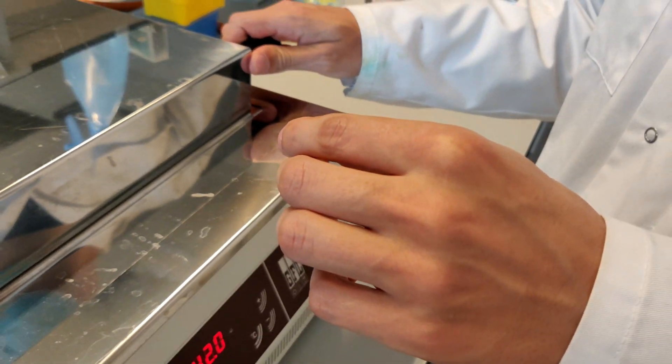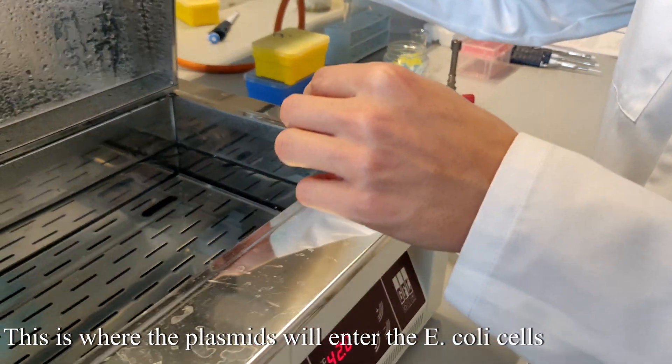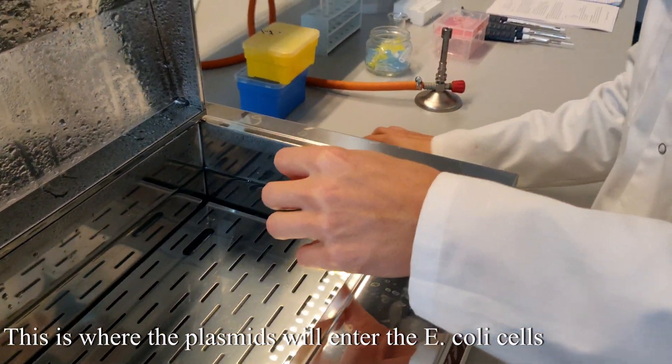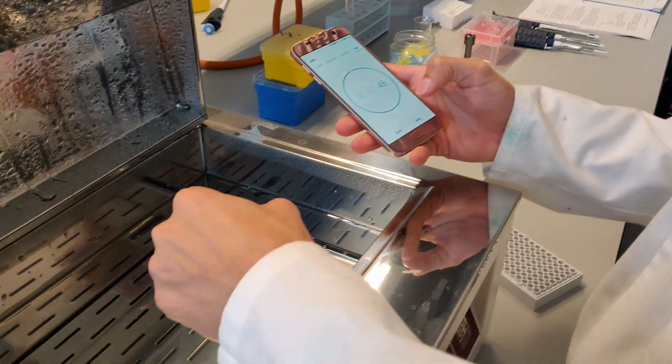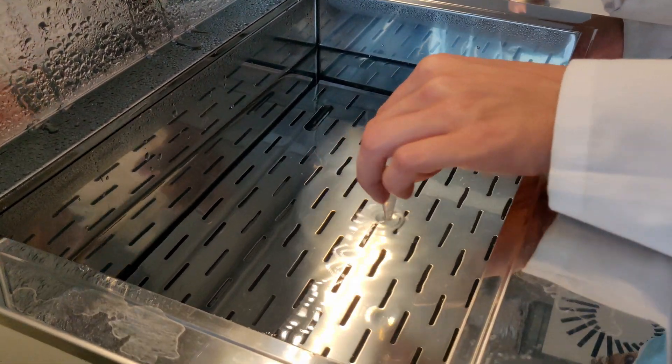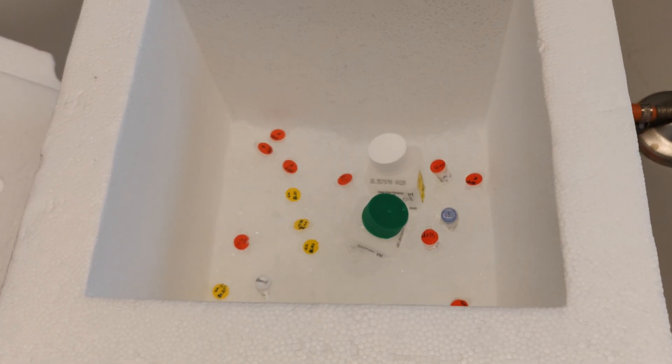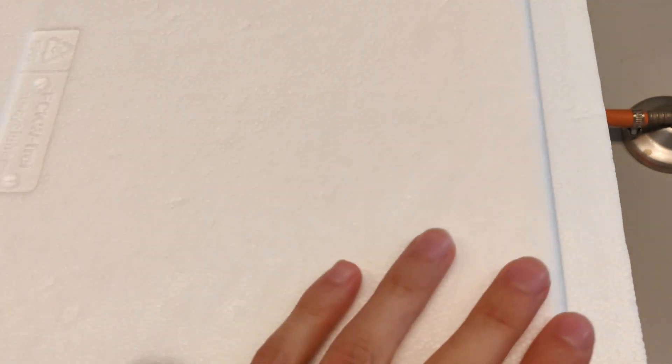Perform a heat shock by quickly transferring the competent cells to a 42 degrees water bath and holding there for 45 seconds. Quickly return the cells to ice and incubate for 2 minutes.